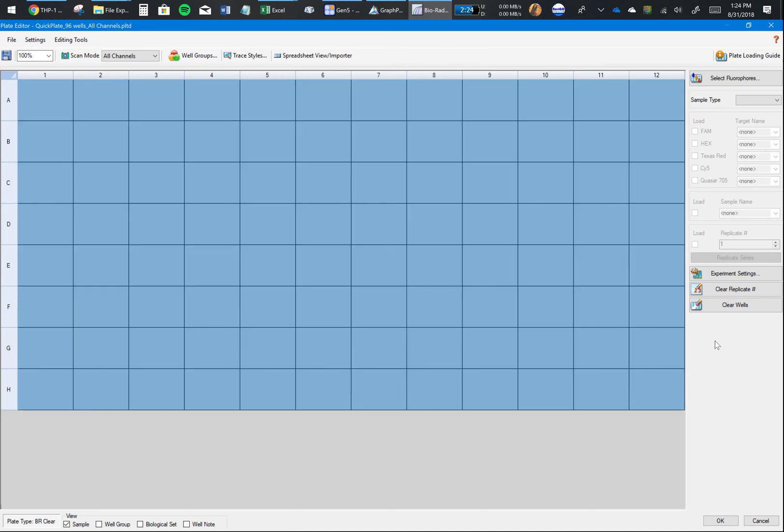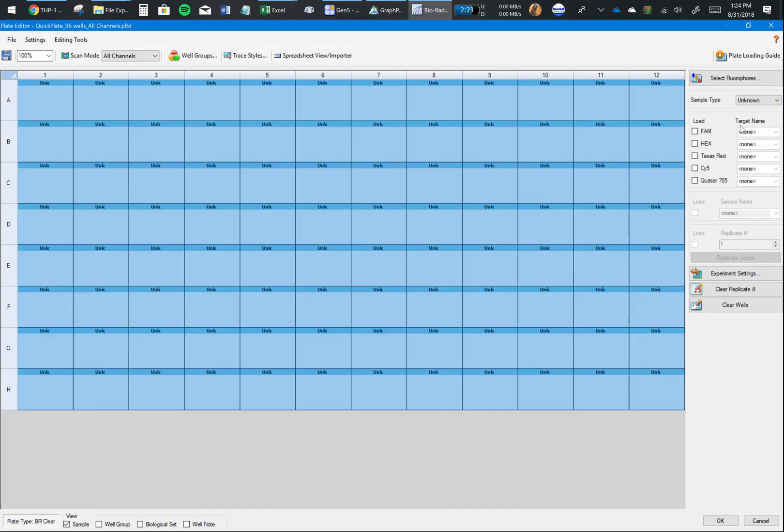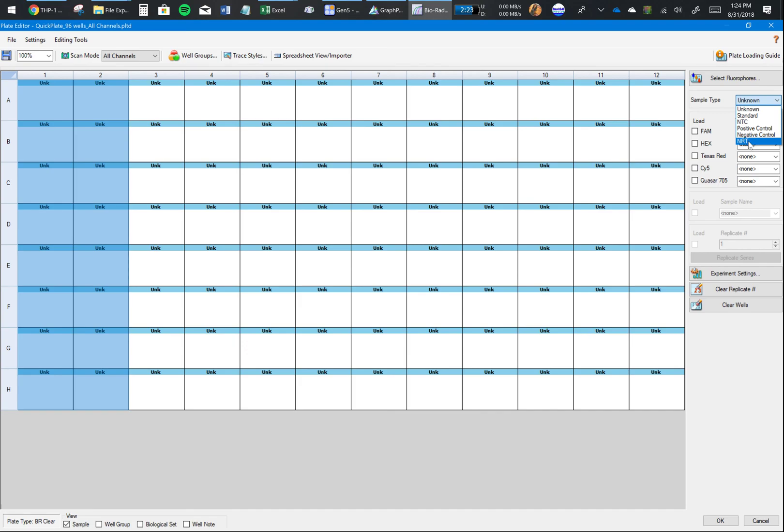Let's say I had a layout where I used all 96 of my wells. I would select all 96 wells. Sample type - let's say Unknown. I have unknowns. If you had some standards, you could put Standard. If you had a no template control (NTC), you could also put that.